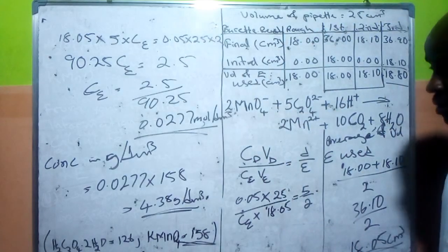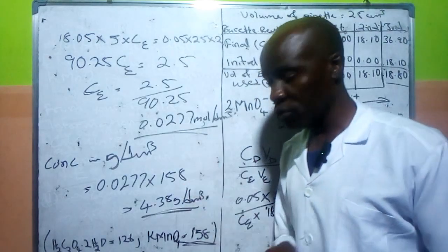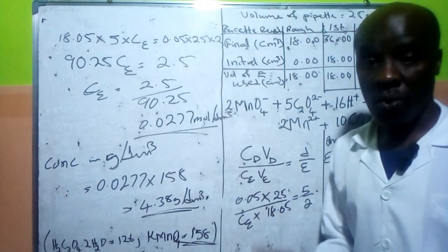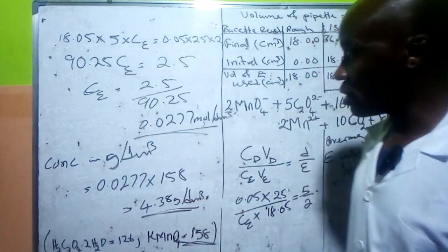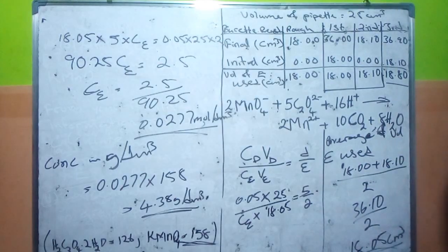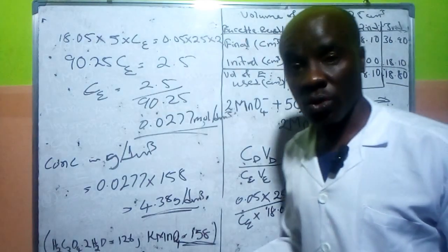But I believe that if I had used something like 1 mole concentration of acid, we might get something different. So this is exactly what I have from my own analysis.